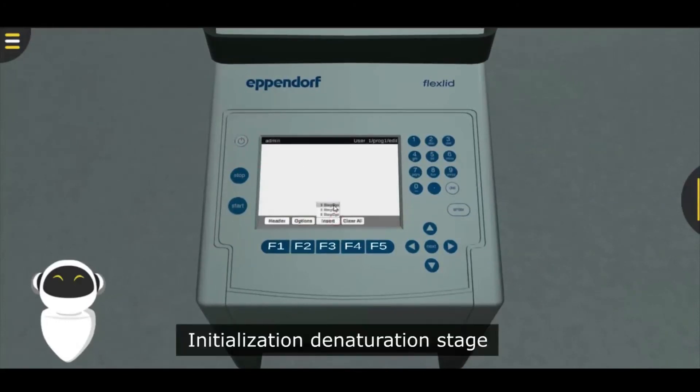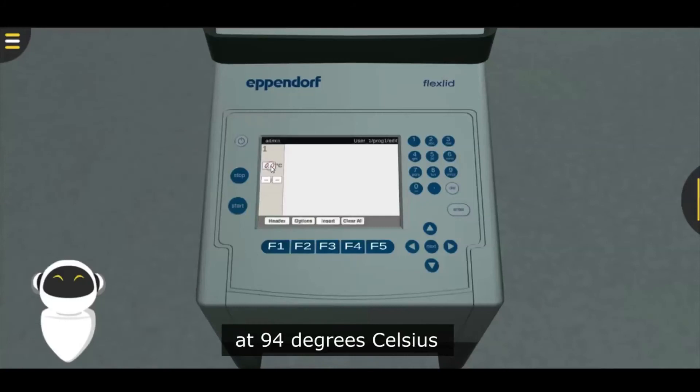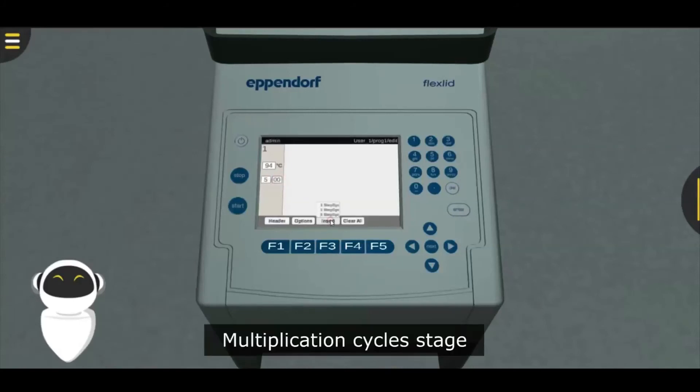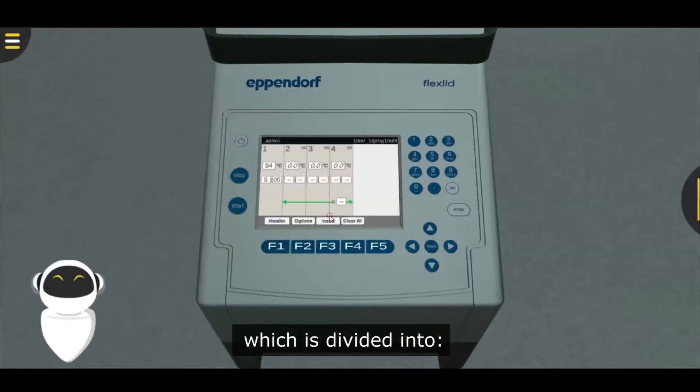Initialization denaturation stage at 94 degrees Celsius for 5 minutes, for 1 cycle. Multiplication cycle stage, which is divided into: denaturation step at 94 degrees Celsius for 30 seconds, 30 cycles.